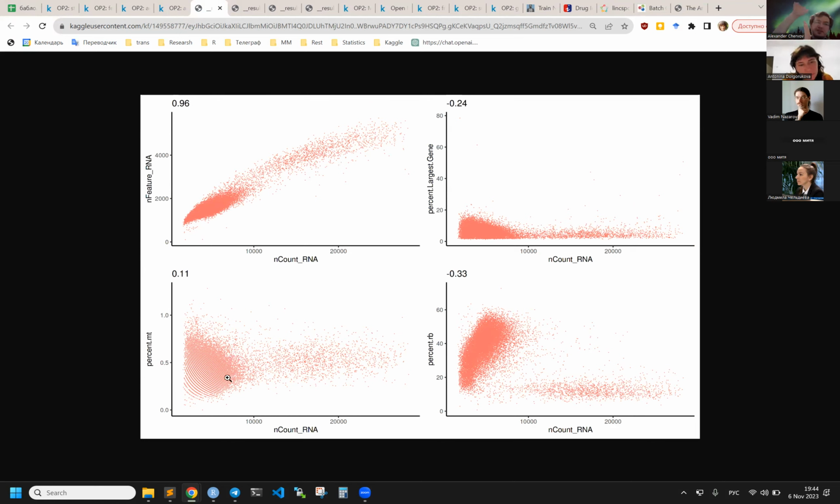So either one is big or the other is big, and so you have something like a hyperbola for this. But this cluster is like a fingerprint. I think it's related to the counts being integers. And here again, no dependencies in this cluster of cells.